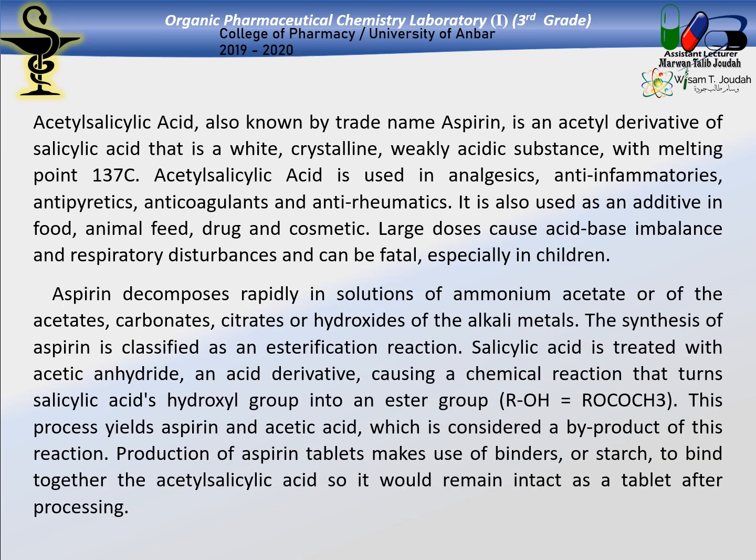Alright. Acetylsalicylic acid, also known by the trade name aspirin, is an acetyl derivative of salicylic acid that is a white crystalline, weakly acidic substance with a melting point of 137. These are the physical properties of this molecule, or of this medication.